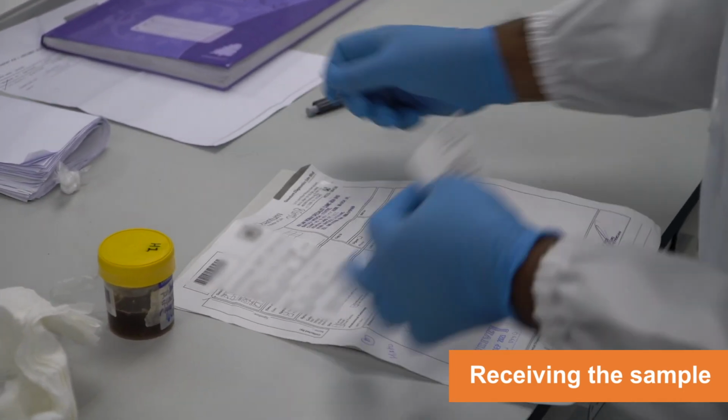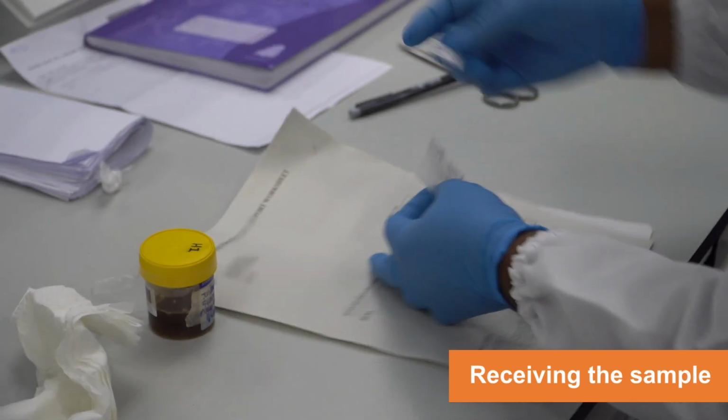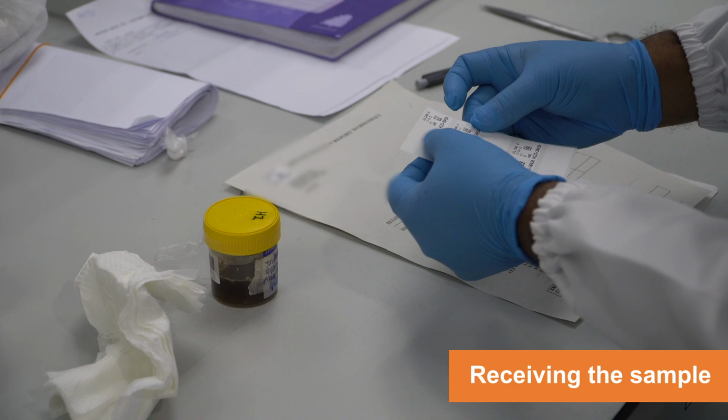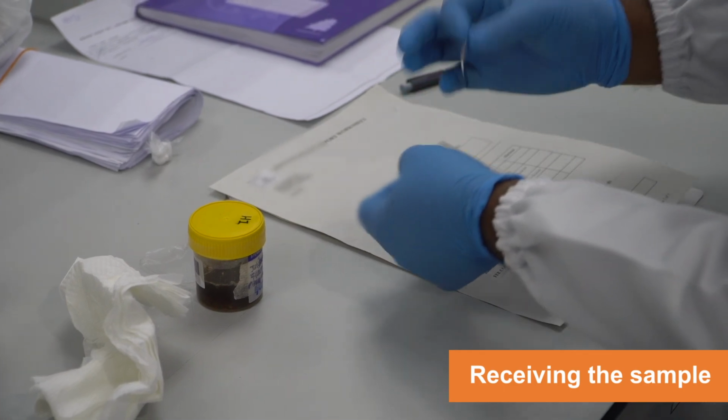Specimens and requisition forms undergo thorough double-checking before acceptance. Data is then swiftly entered into lab records, and specimens are labeled accordingly.